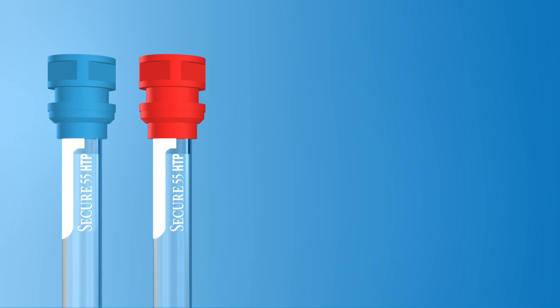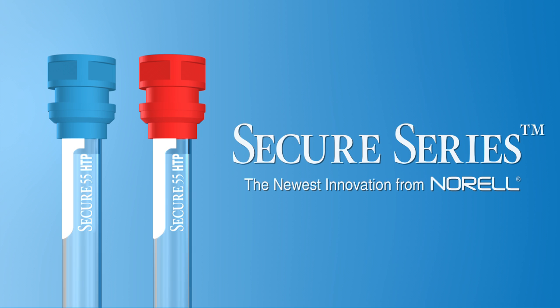Norell is pleased to introduce the newest innovation in 5mm and 3mm OD NMR tubes enclosures, the Norell Secure Series line of NMR tubes paired with the Norell Norlock Generation 2 security cap.